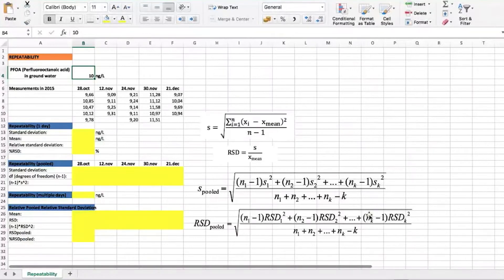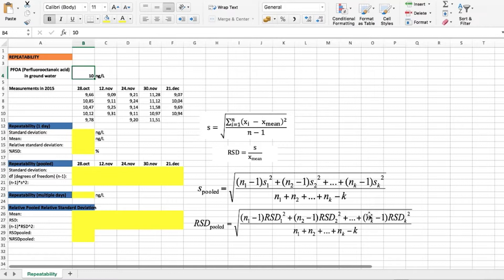Hello, in this video we will see how to use a spreadsheet to evaluate repeatability during our validation studies. As explained in the lectures, repeatability expresses the closeness of the results obtained by analyzing the same object multiple times. Repeatability is the first type of precision considered in the lectures; the second one is intermediate precision, which is discussed later.